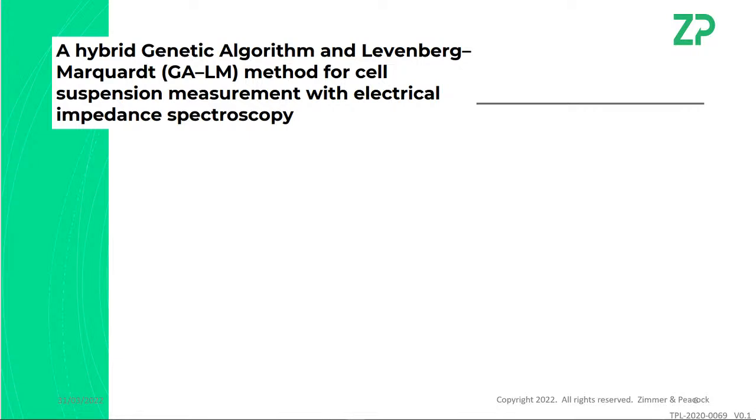They're obviously, because of their buoyancy, essentially in suspension, and the person wants to measure the capacitance and resistive properties of that suspension. They call it the dielectric properties, and I would call this a form of dielectric spectroscopy. Dielectric spectroscopy for me is another term for impedance spectroscopy.